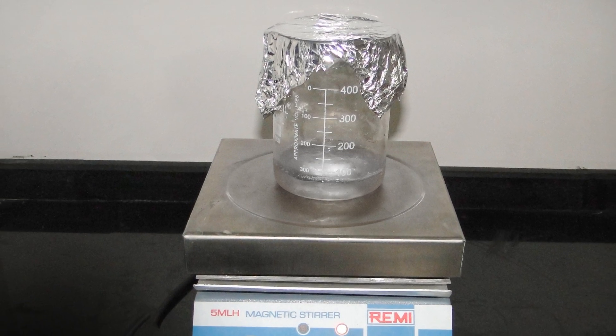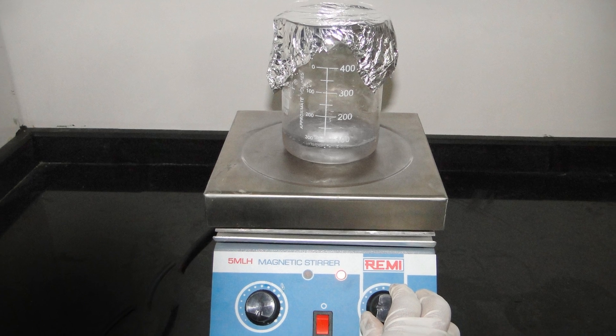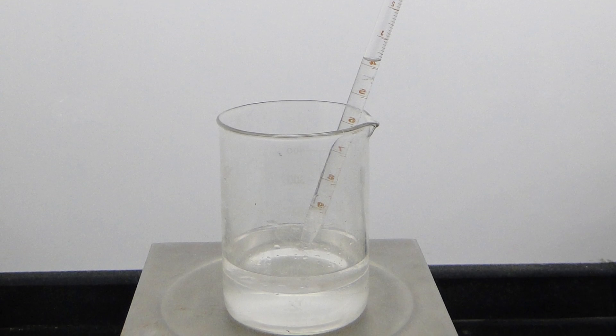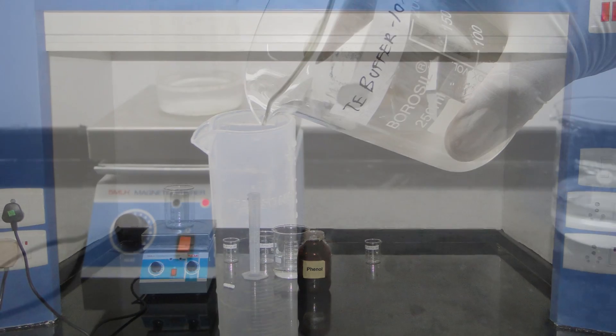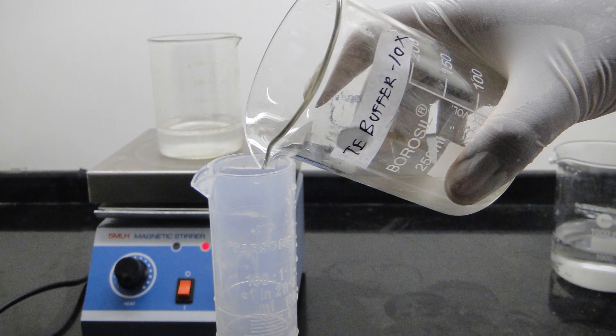Shake vigorously using a magnetic stirrer and allow the layers to separate. Aspirate the top aqueous layer. Do this in the fume hood. Repeat with a second equal volume of 10X TE.